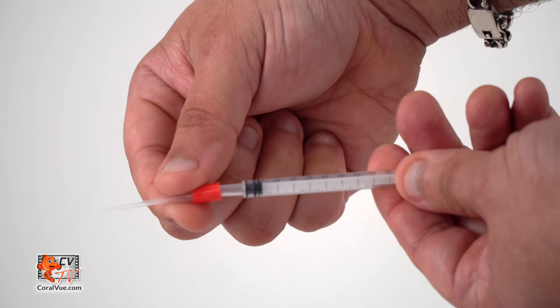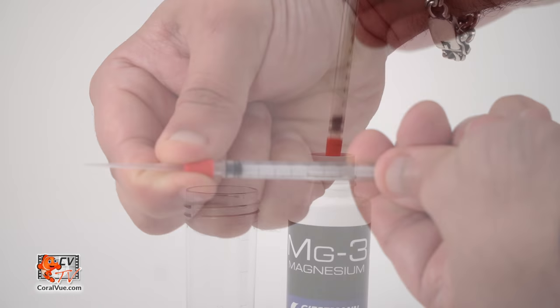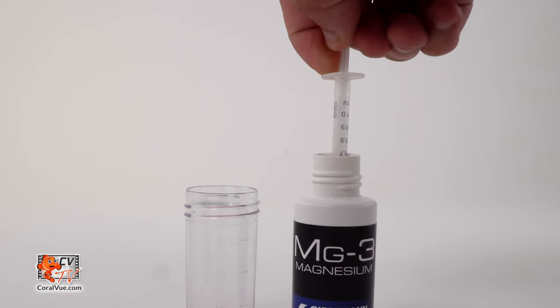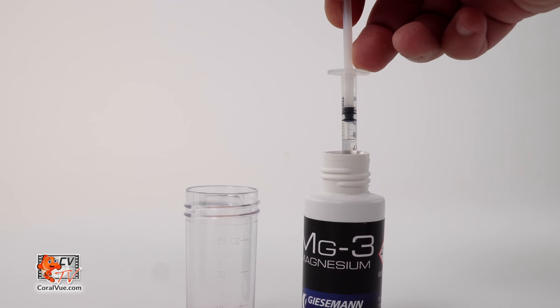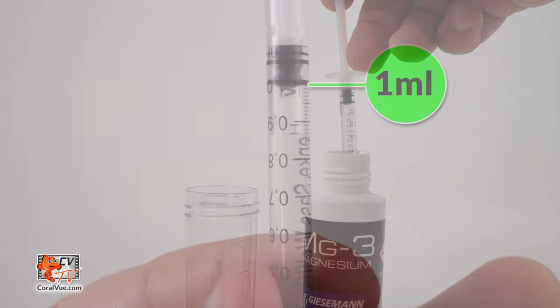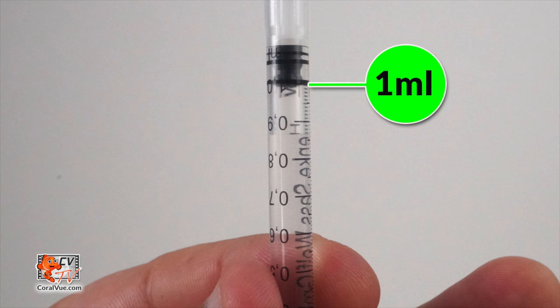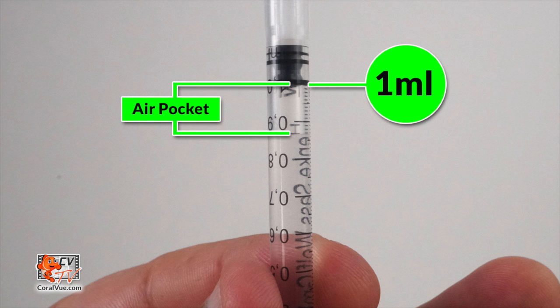Mount the plastic tip onto the 1 milliliter syringe. Fill the syringe with 1 milliliter of MG3 test fluid. Be sure to keep the tip of the syringe fully submerged when drawing the reagent and stop when the lower edge of the black piston reaches the 1 milliliter mark. There will be some air present right below the piston. This is normal. It will not affect the results.